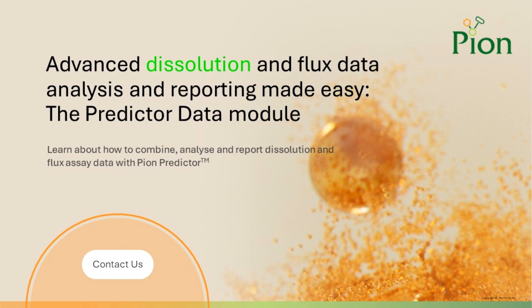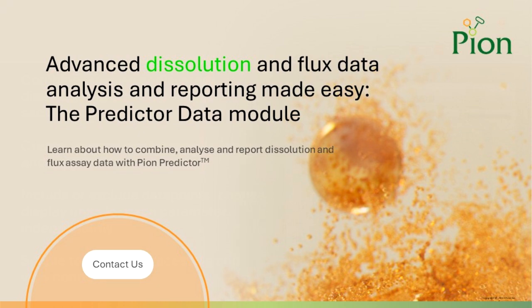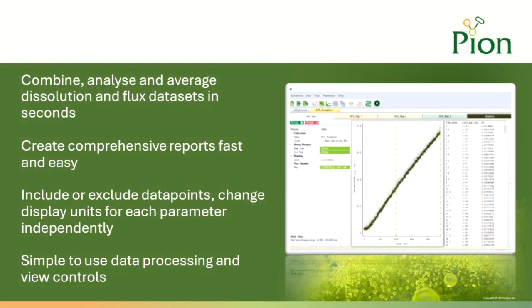The Predictor data module is the core module of Predictor software, which makes data handling, curve fitting, parameter calculation, and result reporting fast and easy. In the Predictor data module, up to 16 replicate concentration versus time profiles can be imported from AU Pro software and managed as one data set.